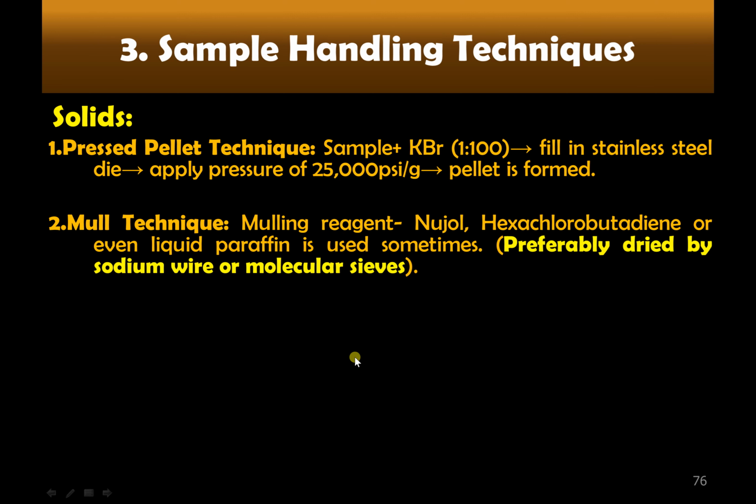Second is the mull technique, which is a suspension of solid in an oil, a liquid suspension, where you use a liquid which is IR transparent, which is either liquid paraffin or Nujol or hexachlorobutadiene, and this is preferably dried over sodium wire or molecular sieves.